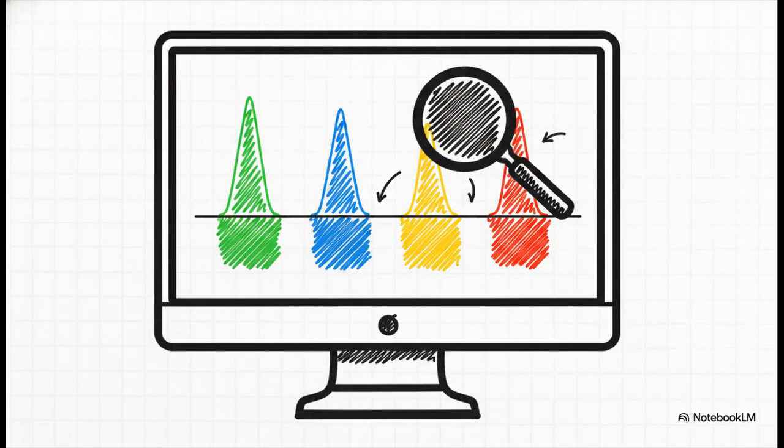And here is what the computer spits out, the final chromatogram. It looks like this long, spiky graph displaying a series of colored peaks. These peaks represent the exact DNA sequence. Each peak is one flash of light. Got a green peak? That's an adenine. The next peak is blue. Boom, cytosine. By just reading these peaks left to right, which corresponds to reading our fragments from shortest to longest, a researcher can literally just read the DNA sequence straight off the screen. It's incredibly clean and visually striking data.